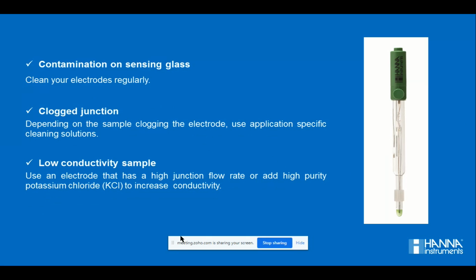You have to wait for a long period of time to get a stable electrode, which might eventually ruin your electrode, as DM water has a very reducing tendency and it will leach the silica, and leach out the reference electrolyte from the reference junction as well, thus ruining your electrode completely.